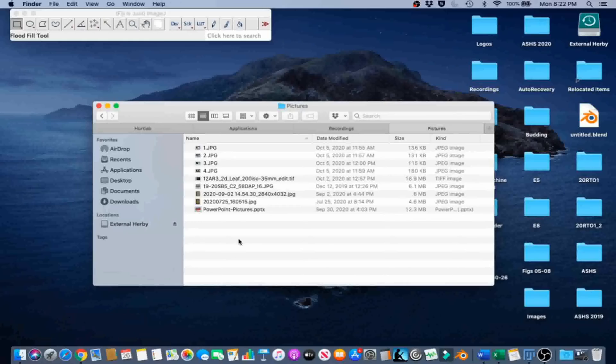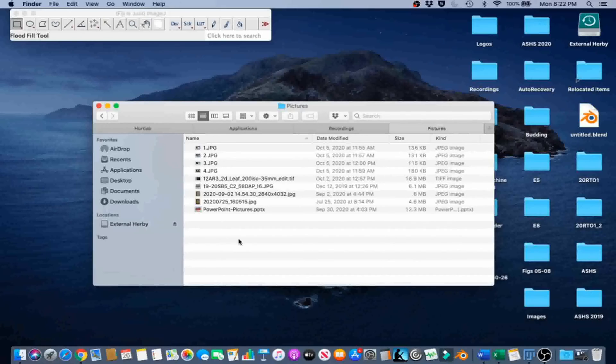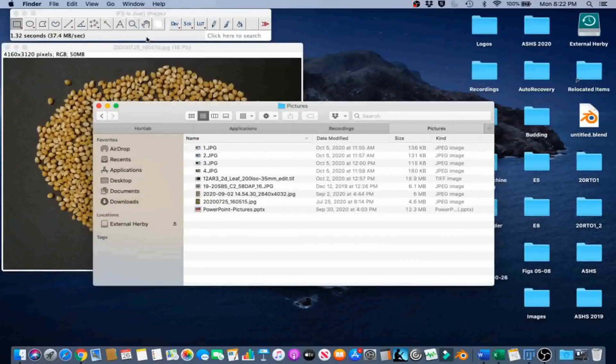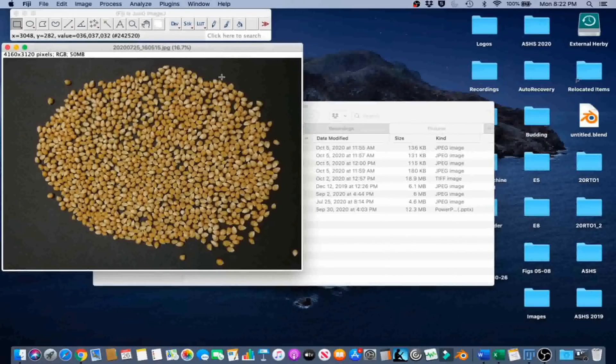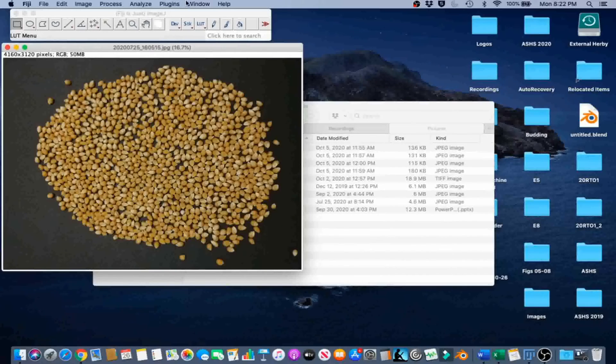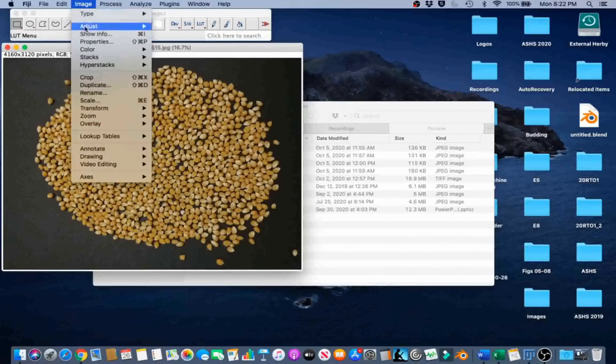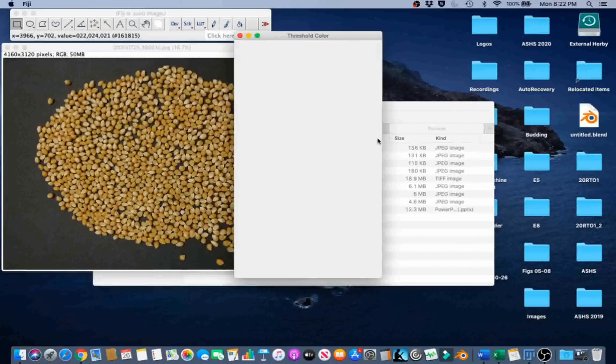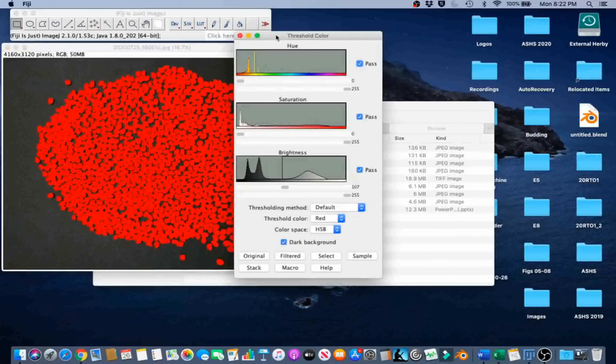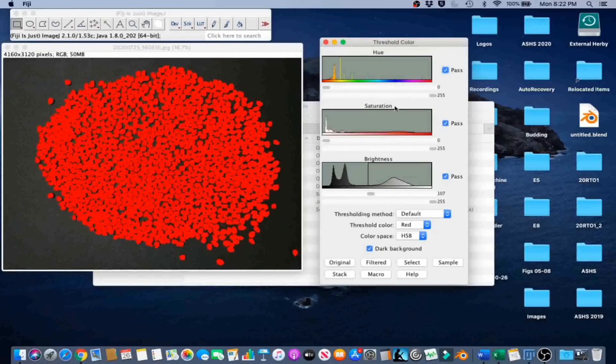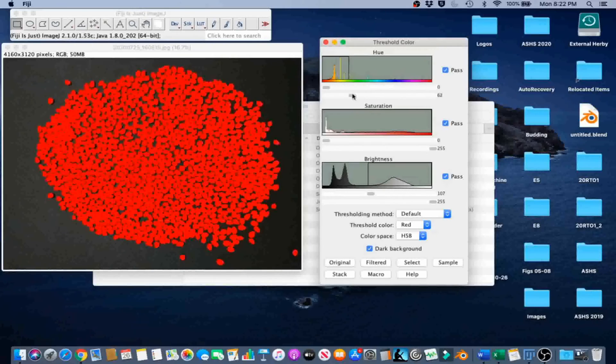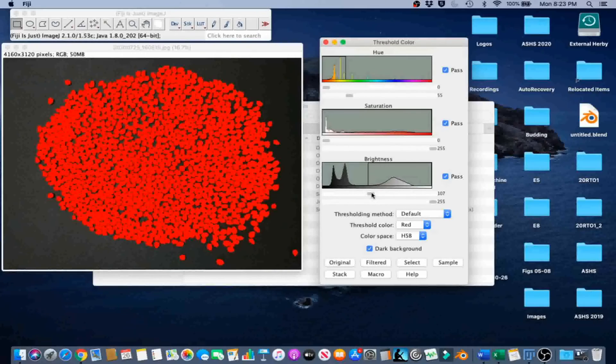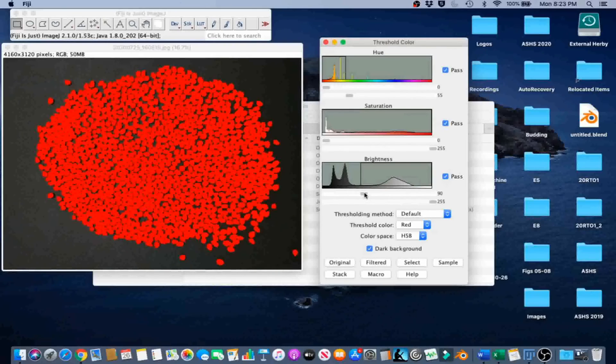In this example, we will count the total number of corn seeds in a photograph of corn seeds spread on a table using the automatic count feature in ImageJ. Let's drag the image onto the graphical user interface in order to open it up. This photograph was taken using an LG H74 smartphone. Go to ImageJ, Color Threshold. In this case, a hue between 0 and 55. Saturation between 0 and 255. Brightness between 90 and 255 works pretty great. Go ahead and select.